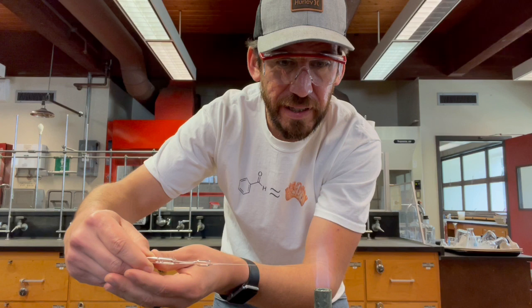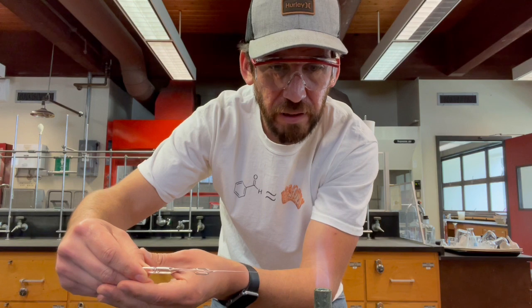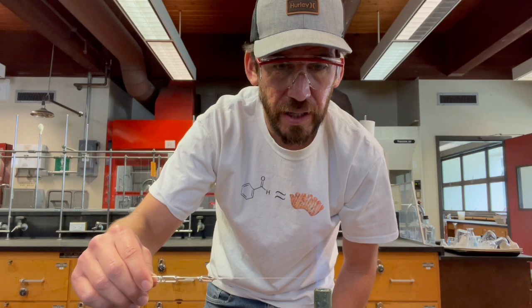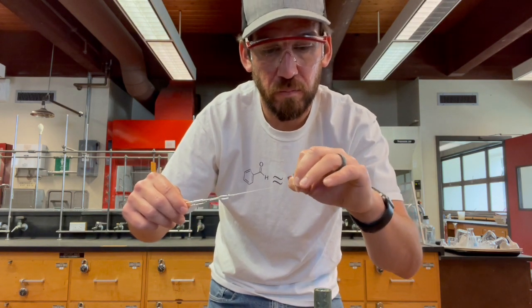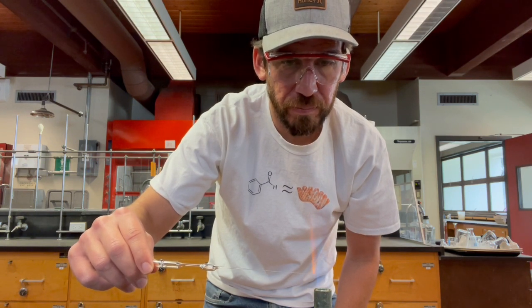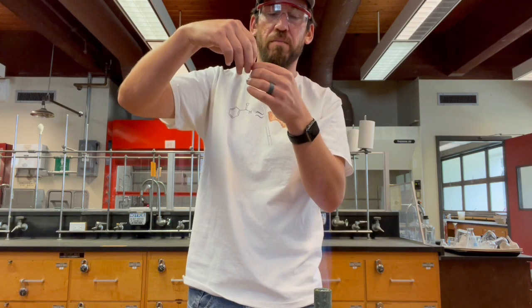You see when you start seeing that yellow flame, or the yellow-orange, that means the glass is touching, and that means I don't want to put it any further than that, because if I do, it's going to melt more of the glass that I'm going to make the micro bell out of, and we don't want it to bend like that, because then it won't fit in the capillary tube. Okay? Less talky, more chemistry. Okay, so now I'm going to go ahead and break this off.